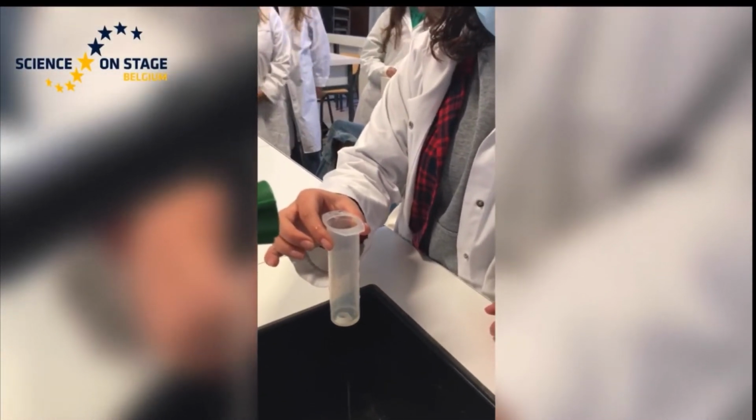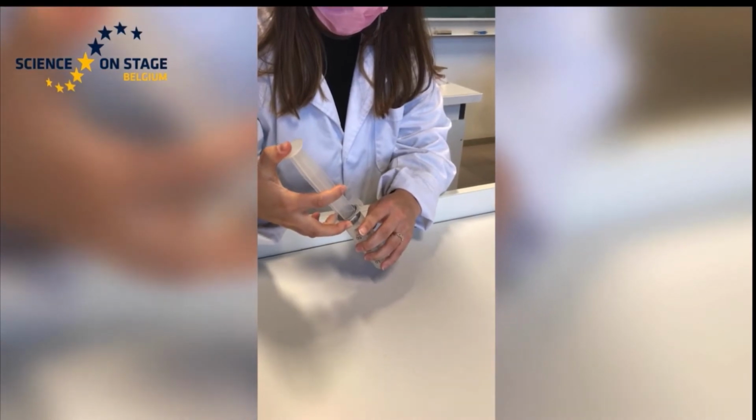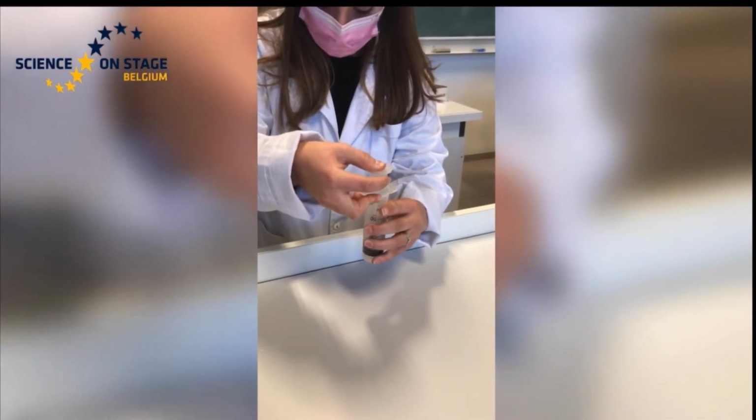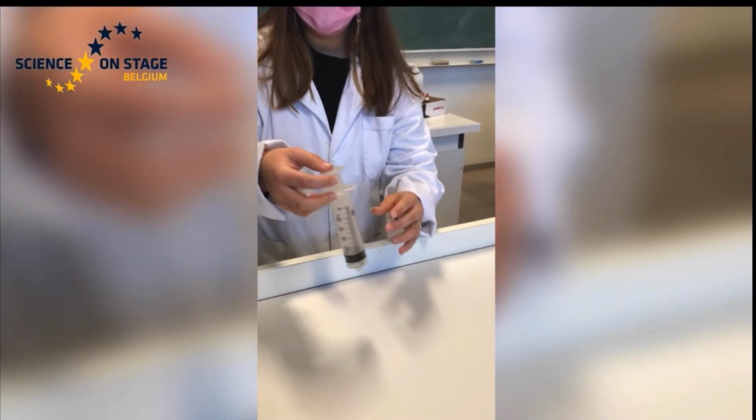We fill the syringe with water, delicately put the small stopper, and then we let the water flow until the small container arrives in the good direction at the bottom, like a boat in a lock. Then we insert the plunger of the syringe. It's the delicate part. It's important to avoid jerking the syringe so as not to turn over the container of magnesium.